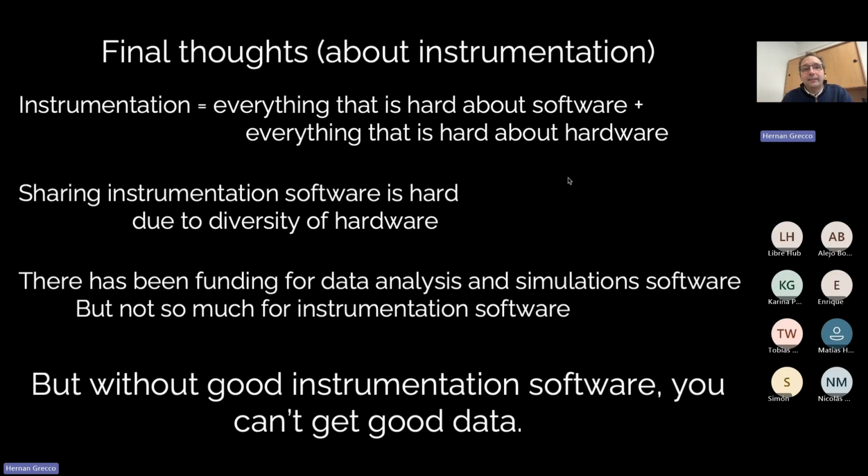There has been funding for data analysis and funding for simulation software, but there has not been so much funding for instrumentation software. And I think that is a pity, because if you don't have good data, then it doesn't matter how good the data analysis is. If you don't have good data, it doesn't matter how good your simulations are to simulate nature conditions. What you want is good data, and to generate good data, you need good instruments and good instrumentation software.